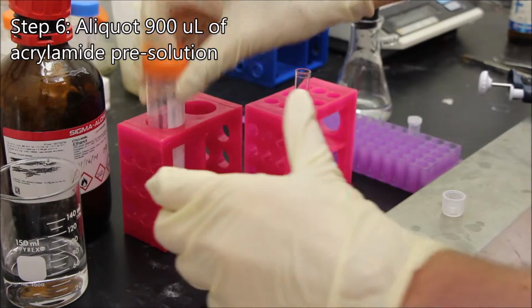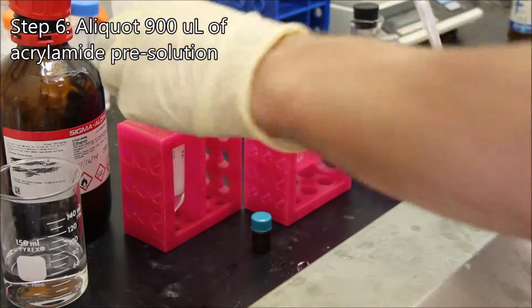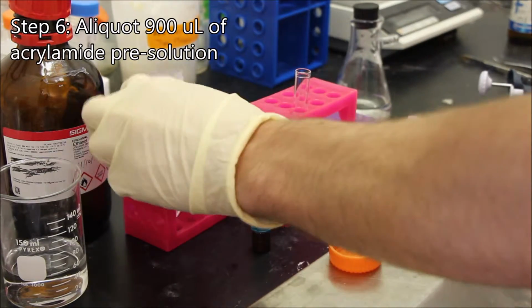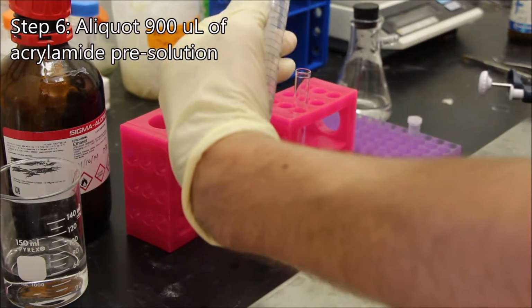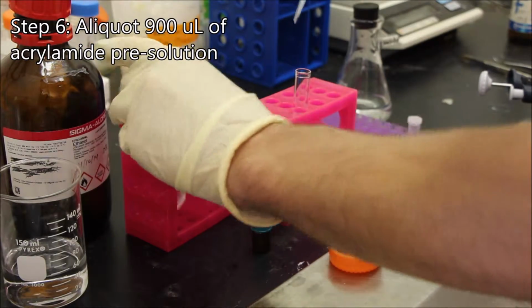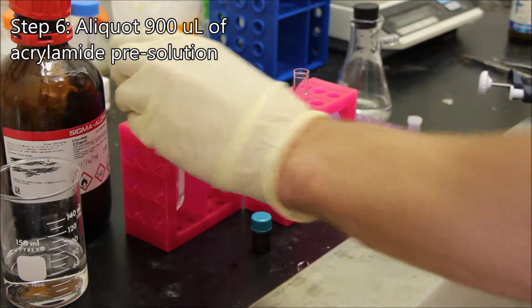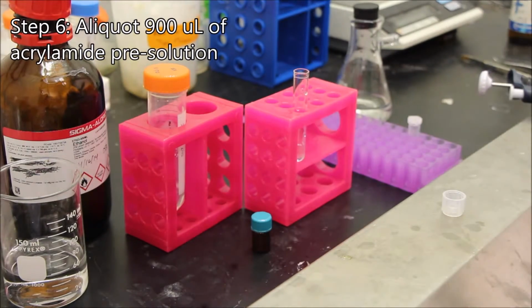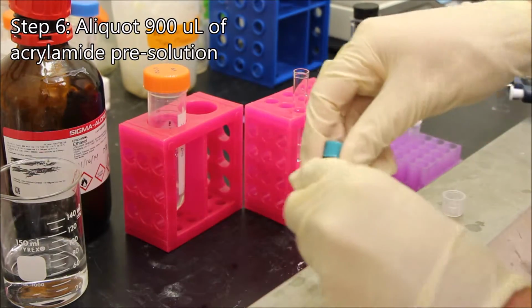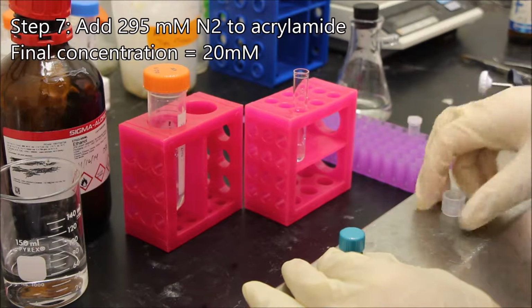So to make gels today, I'm going to take 900 microliters of this portion, place it in this polystyrene tube here. It's at a low pH, which will increase the half-life of the NHS group on this linker. So I've got 900 microliters in there.